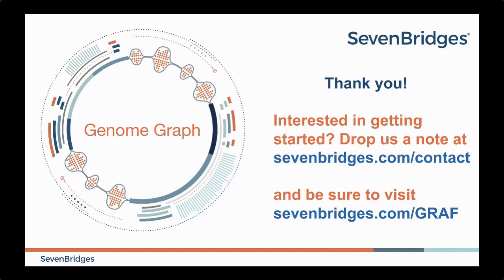Okay, this next question is also from Bryce. Have you used this, presumably meaning graph genomes, to look at situations where there are CNV alleles at different frequencies in large populations? For example, could a graph be constructed that would be able to incorporate a specific CNV or identify one with more confidence when dealing with population scale cohorts, especially with short read data? Yes, so as far as the current released graphs are concerned, we are able to do that.